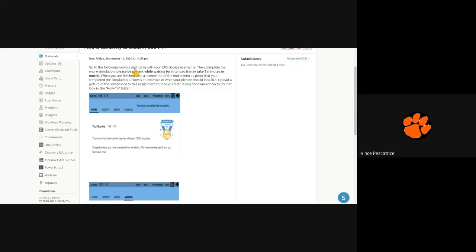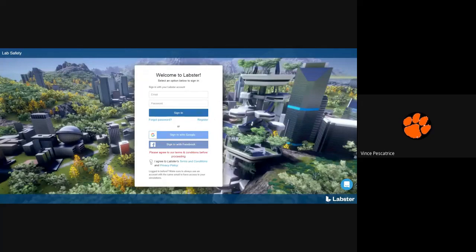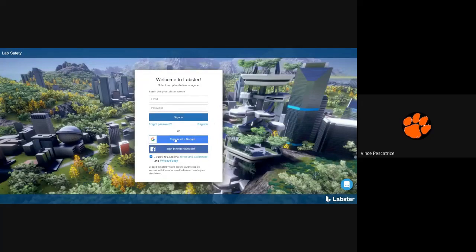So you're going to click on this website. When you get to that website, you're going to log in with your CPS Google username. So you should come to a screen that looks like this. You're going to sign in with Google. I'm going to do that. There's that one.